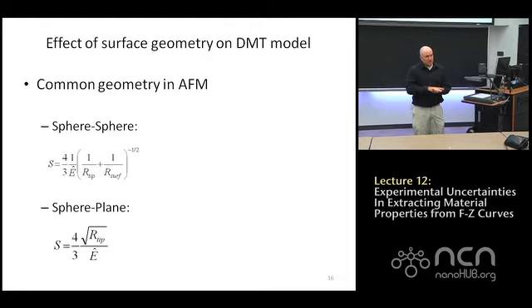The generalization of Hertz for any shaped tip is called the Sneddon model, which is an axisymmetric punch indenting a plane. They also do something called the Oliver-Pharr approach, where they indent way into the sample, then let the sample relax and withdraw, and measure the force very carefully. So when you go to much larger indentations, you deal with that model instead of the model I'm talking about, which is DMT. Does that make sense?